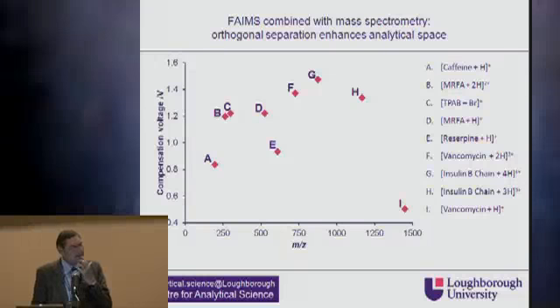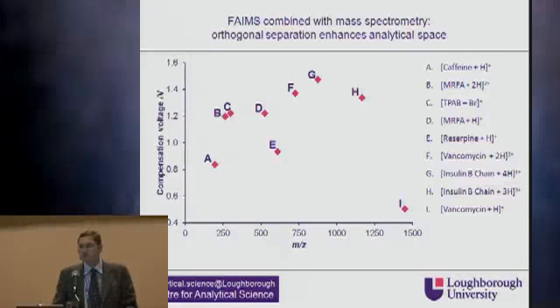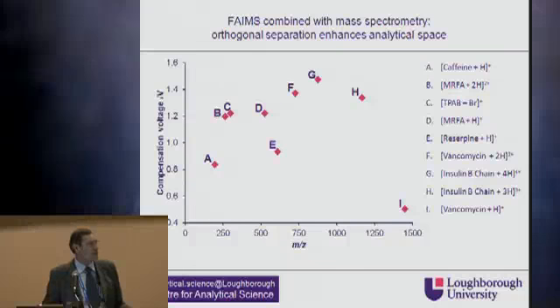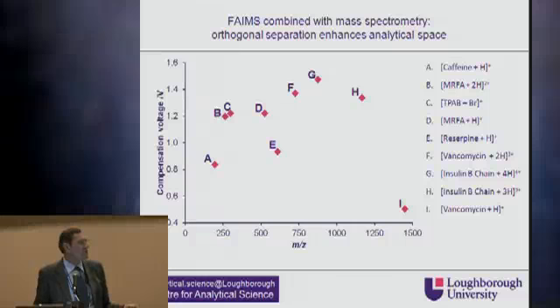So I was asked if I could look at a variety of different pharmaceutical-related things by Alex in the presentation today. And I wanted to start by making a general point that, like drift tube systems, if we've got an ion mobility device of some sort and a mass spectrometer, then we can look at the working point of an ion, which has been separated by our mobility dimension and our mass to charge ratio dimension. In the case of drift tube systems, we would be plotting mass to charge against the ion drift time, as we saw in the previous presentations.